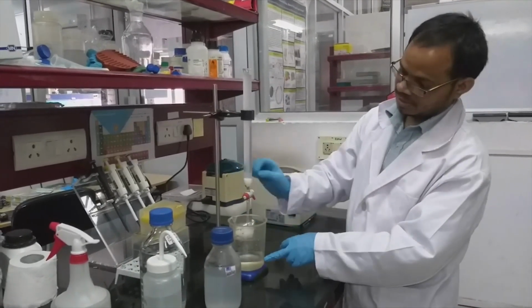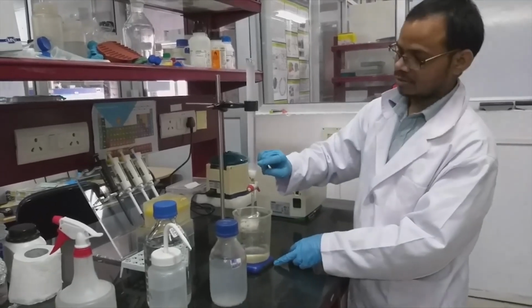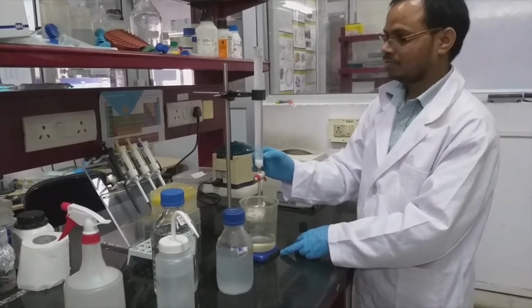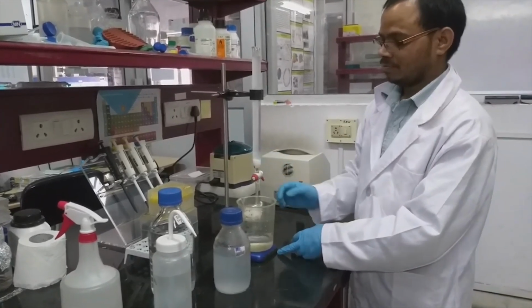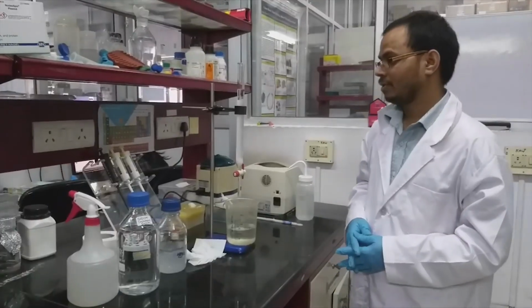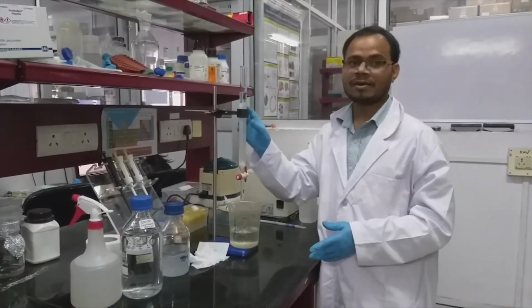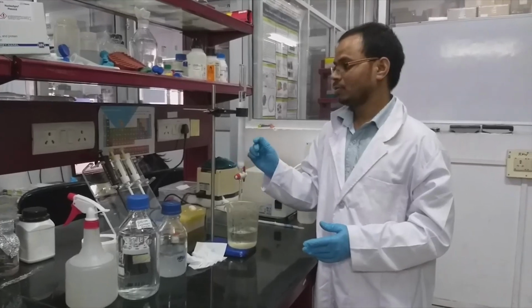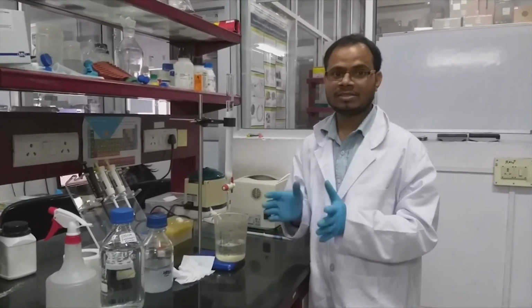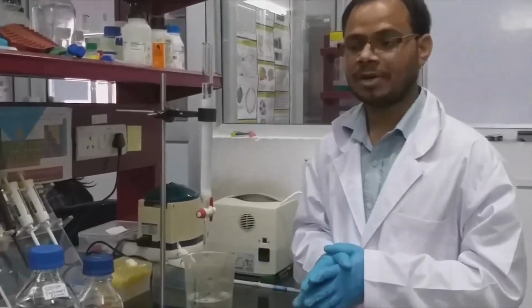Beads are settling, as we can see the beads are settling properly at the bottom of the column. Now as you can see, we packed the column properly. So now the next step is we have to load the sample.